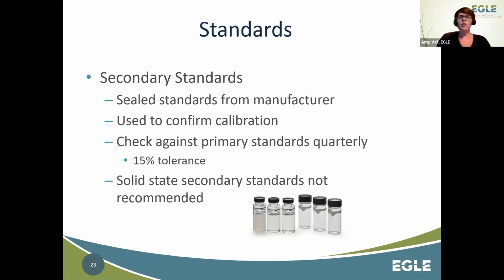They do have solid state ones, but they're not really recommended. I think Hach makes one called IntelliCal. They just aren't really good standards to use, so we don't recommend those. Not we as Eagle, but in the laboratory industry.